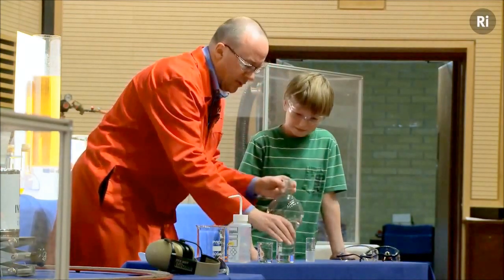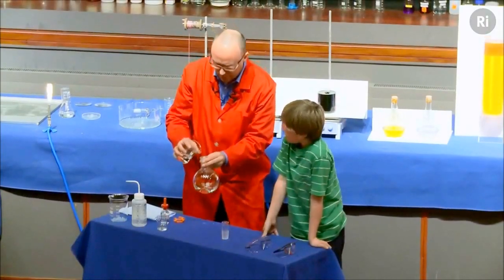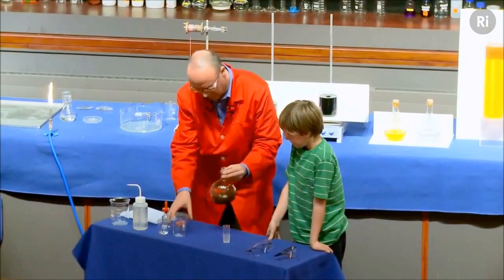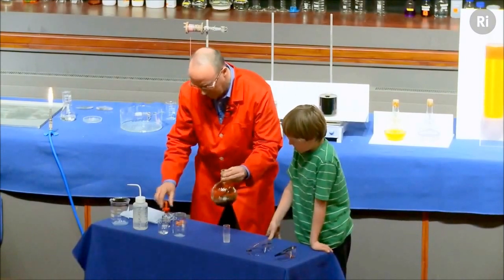There you go, it's disappeared, isn't it? Now what I'm going to do is to add some sodium hydroxide. That's now formed a sort of very dark brown, almost a black material.